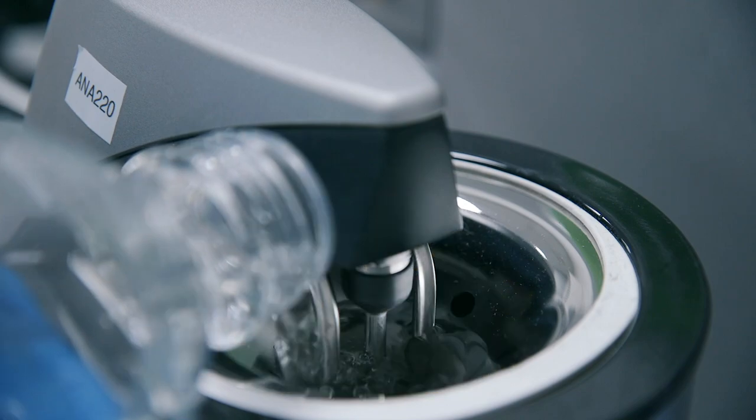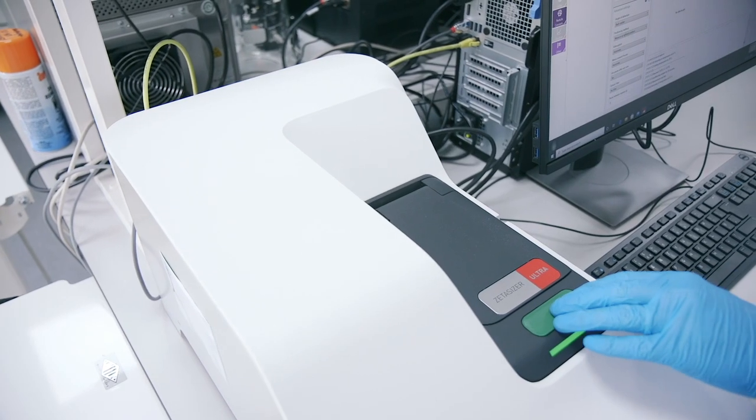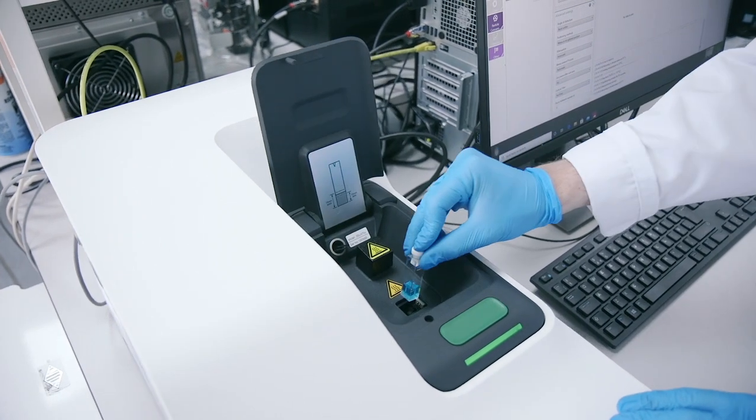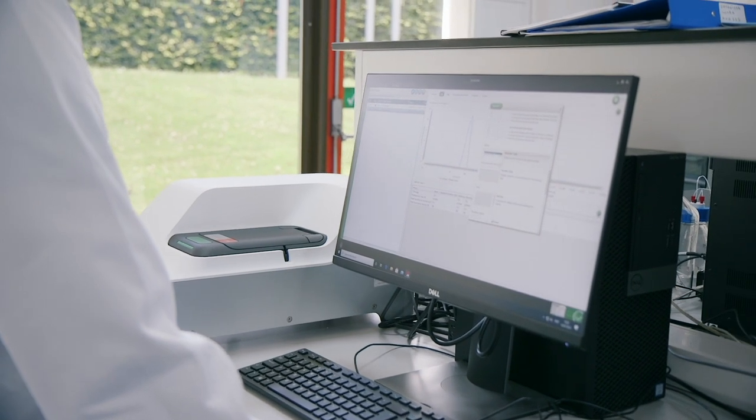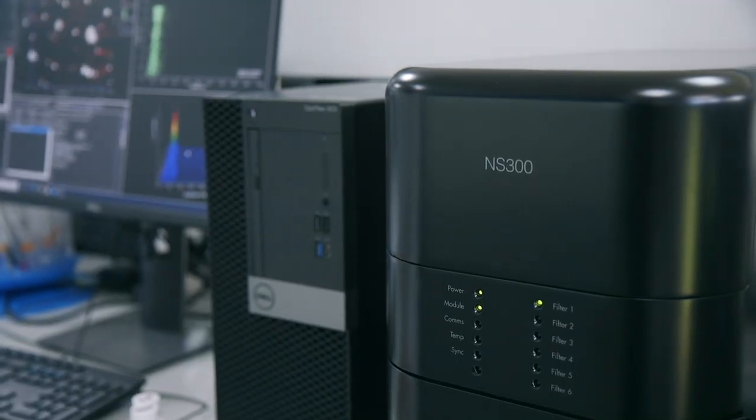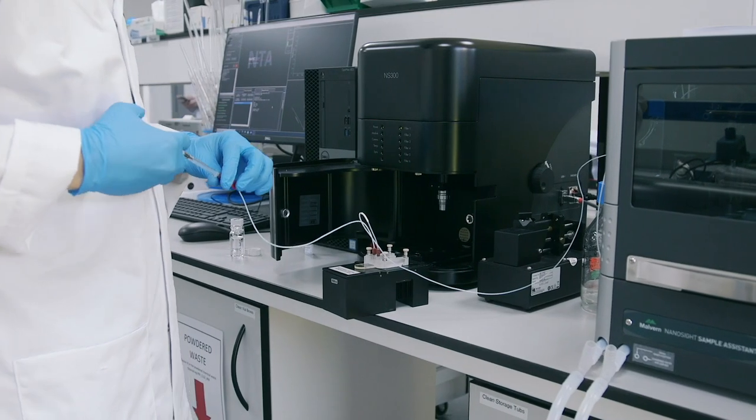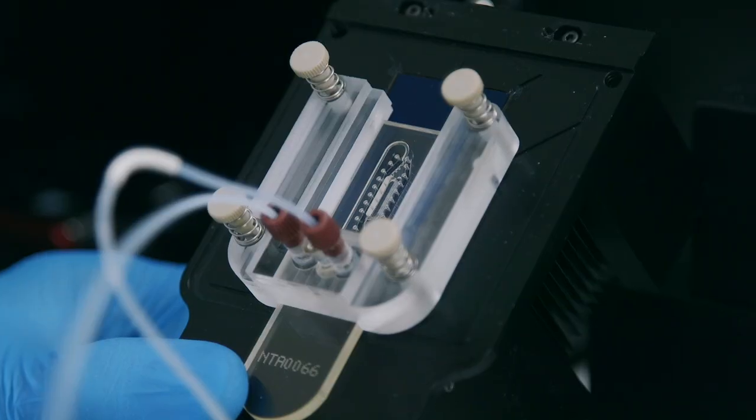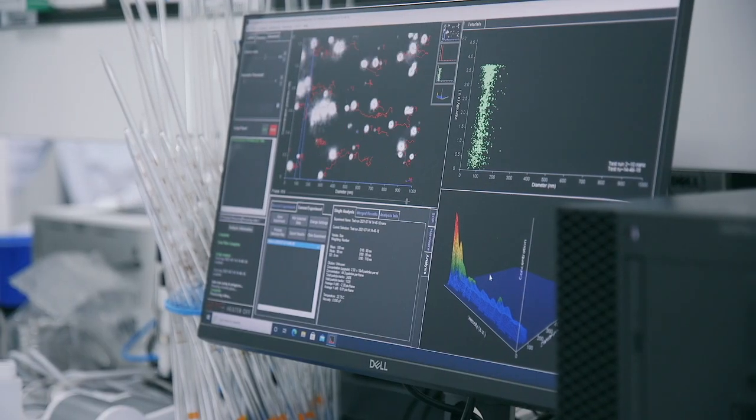This lab also hosts the Zetasizer Ultra light scattering system for particle size analysis at the nanoscale. The Zetasizer can also be used to measure particle concentration and zeta potential, which can impact a sample's stability and its propensity to aggregate. Complementary to the Zetasizer is the NanoSight NS300 with its Sample Assistant autosampler, which measures particle size and concentration via nanoparticle tracking analysis. This system can count and size over 1000 nanoscale particles in just 60 seconds.